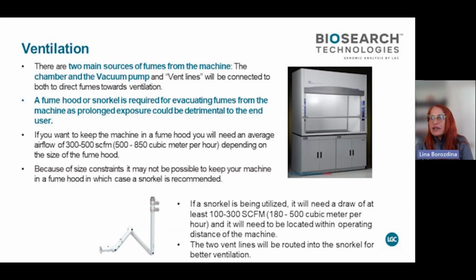So ventilation, as I mentioned: this is the chem hood, and this is the snorkel. It's kind of an arm that comes in from the ventilation. You can bend it. It has a little dish on it, and it pulls out the smell that comes out from the vent of the instrument and also helps you when you put the reagent on.